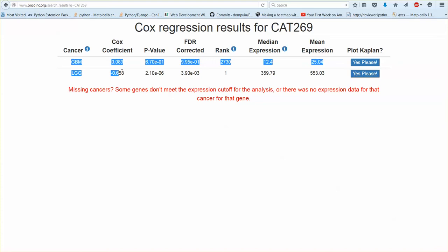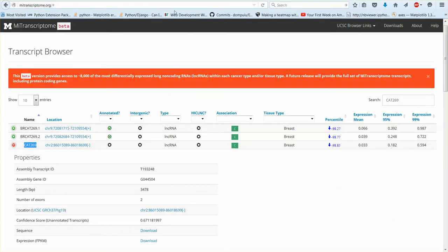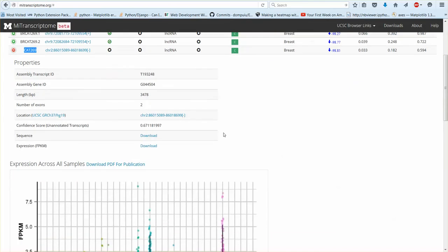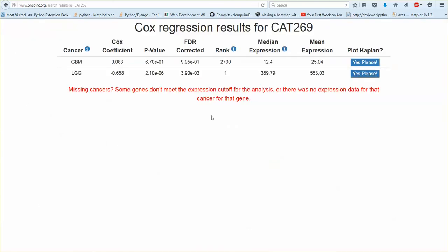Yeah so we have this error message, why do we only have two cancers? So when I perform the Cox regression analyses I have an expression cutoff and if the gene doesn't meet the expression cutoff then an analysis is not performed for that cancer. And long non-coding RNAs as you can see they have very low expression in many many of the cancers. Here you see that lower grade glioma has high expression and not surprisingly the LGG has high expression.